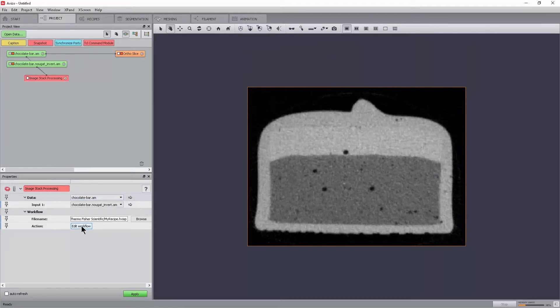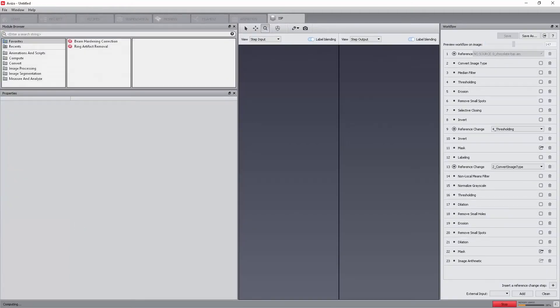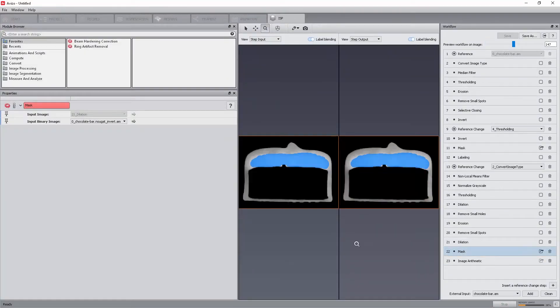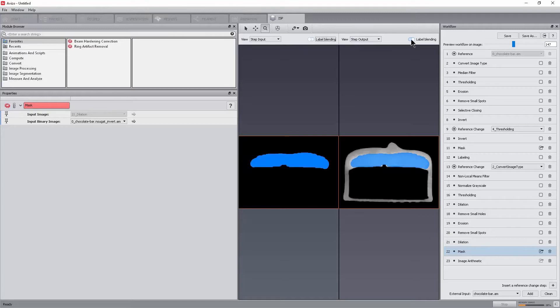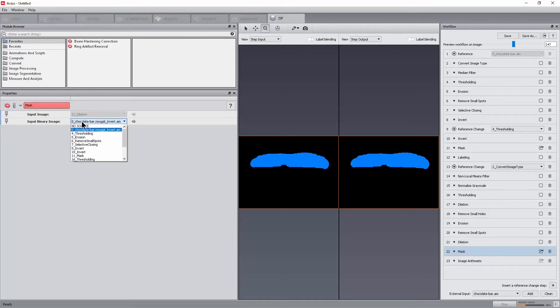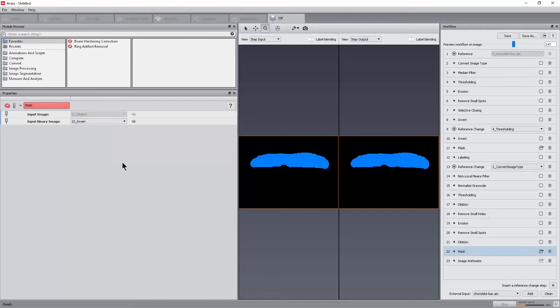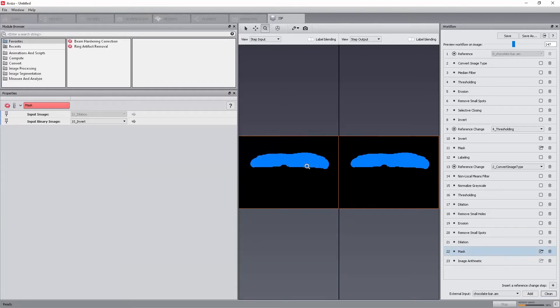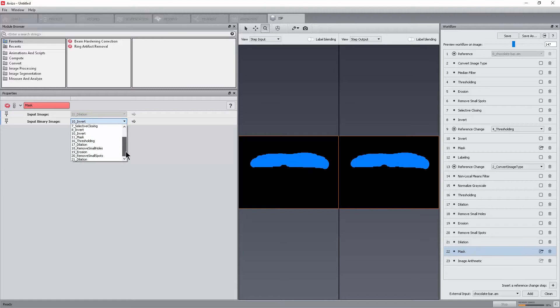For the purpose of the tutorial, we will now remove the extra step to have only one main input. In the last mask step, select back the result of the invert step as binary image. Click Clean. The message lets us know that an input has been removed. In mask module, the chocolate bar nougat invert is no longer available in the input binary image list.